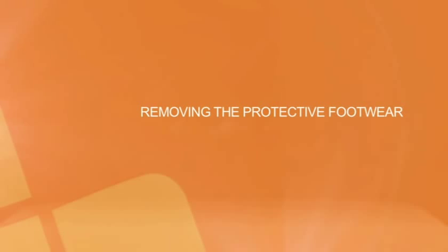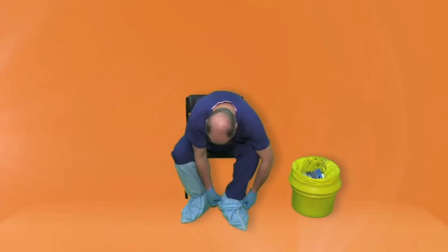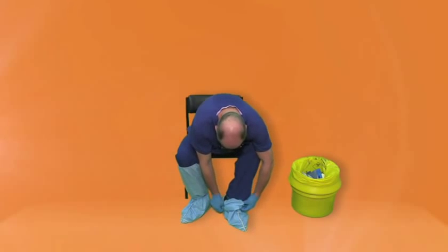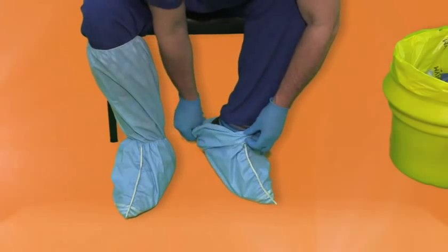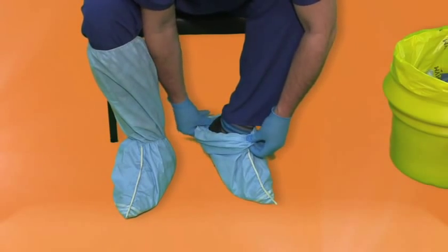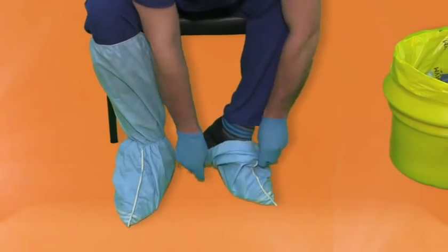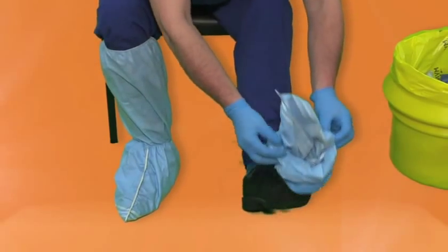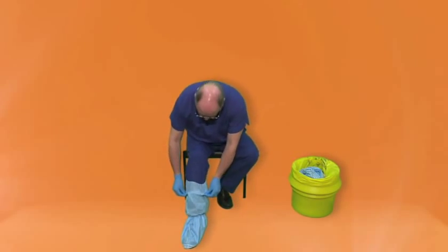Protective footwear. Sit down on a firm, stable and cleanable seat. Grasp the protective footwear by the ankle elastic and pull over the heel, avoiding touching the trouser leg. Keep pulling the protective footwear until it has come off, then repeat this process with the other foot. Dispose of the protective footwear as clinical waste in a yellow bag.